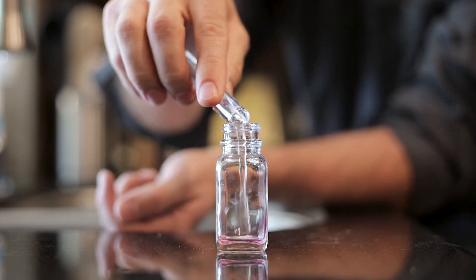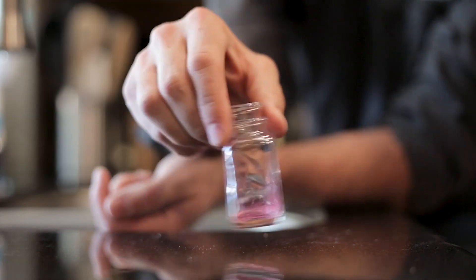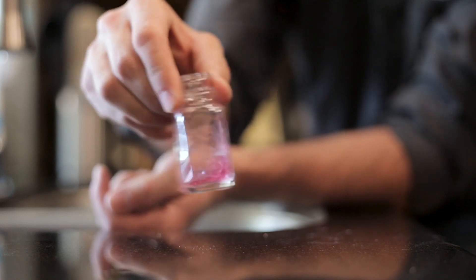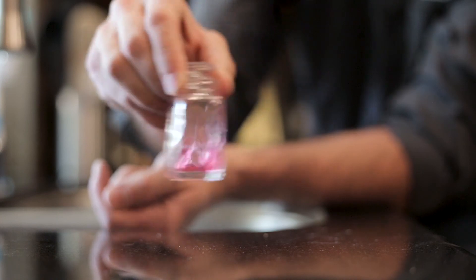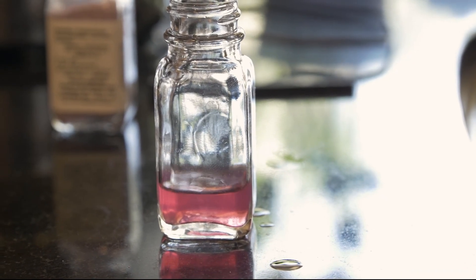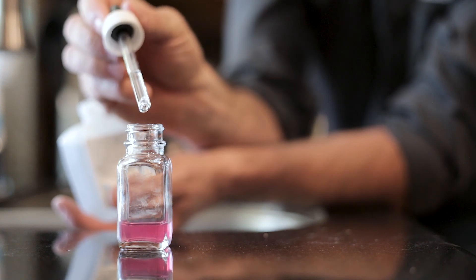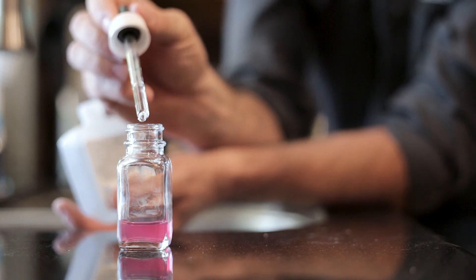We dump the vial into our jar with the reagent. If the water is pink, that means our water is still hard. We're then going to take our solution, and every drop represents one grain of hardness, until the solution turns purple.